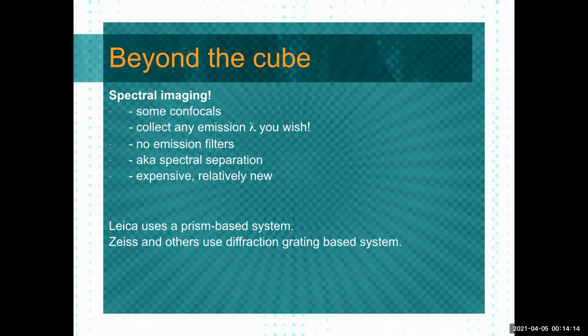You still had filter sets for emission at least, because you're usually using a laser, so that's actually just one color. It's not even a spectrum of colors. But you were still having this issue of what do I do about the light that I'm collecting.